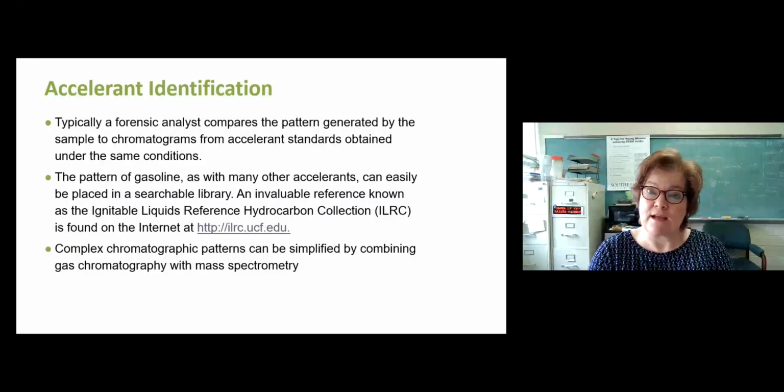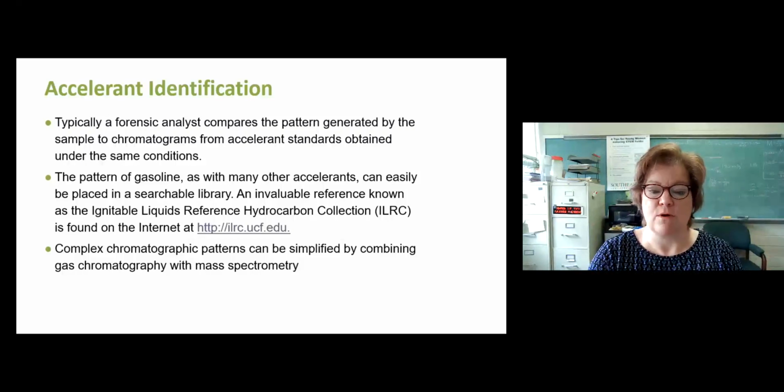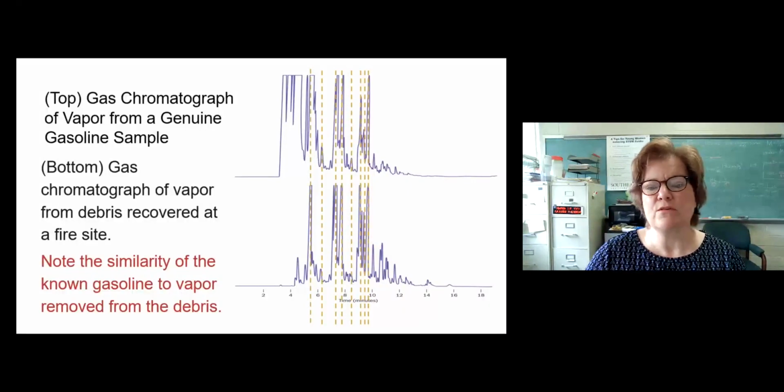Again, we're going to compare the pattern generated. The sample comes in, and we do either the headspace technique or that vapor concentration technique to collect the sample from the fire debris, and then it's run through the GC and compared to this library of different setups. So here's what it might look like.